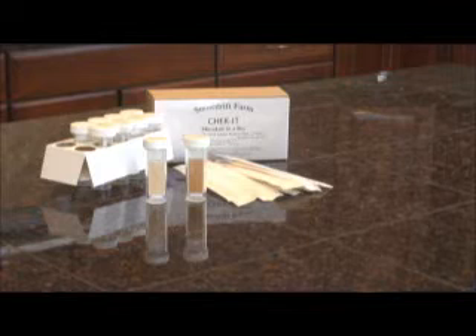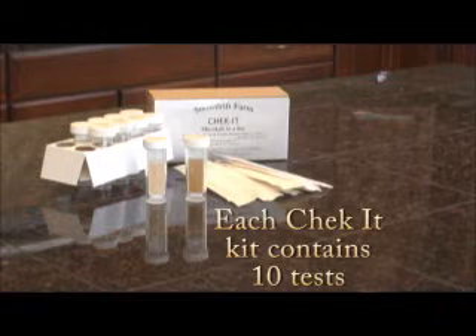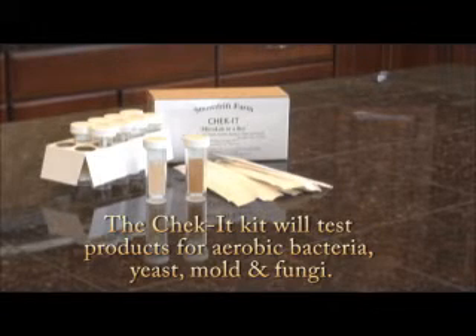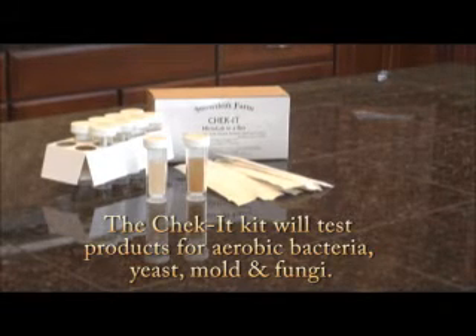Snowdrift Farms Check-It Kits will inform you if your product contains any contaminants. Our Check-It Kit will determine if you have a sterile process and if your product meets FDA requirements for cleanliness. Although the kit will not determine the exact types of colonies, this can be determined if needed by sending the Check-It cultures to an analytical lab.